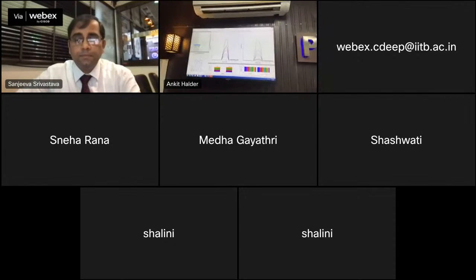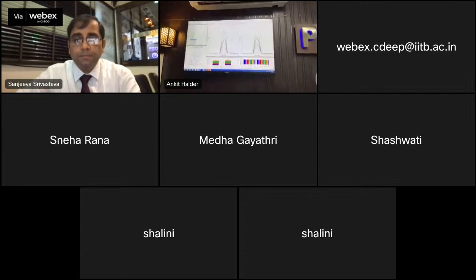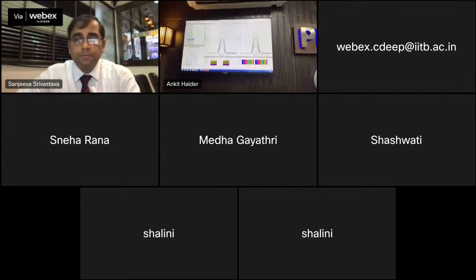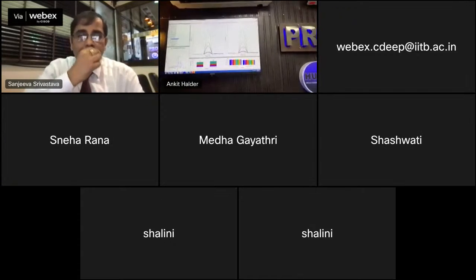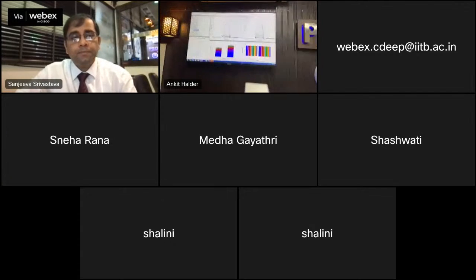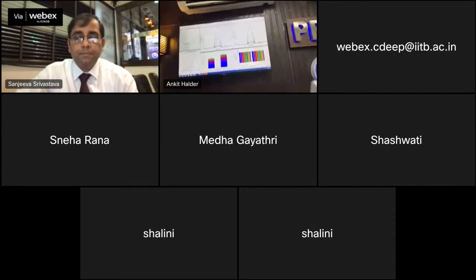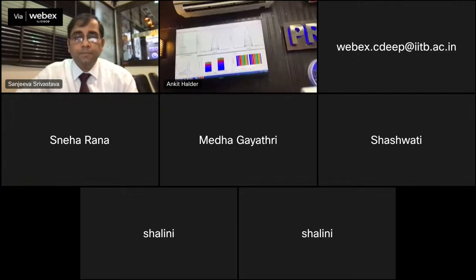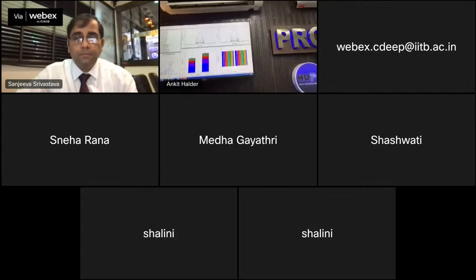Here you can see, on the left hand side, a list of peptides. This is our target panel, the target list of peptides that we had run in the instrument, and then we can see in different samples how the peaks are looking, or how their trends are. As here we can see, for this particular peptide, the peak is looking like this. The different lines, in different colors, represent different transitions. And here we can see the trends of peptides in different samples.